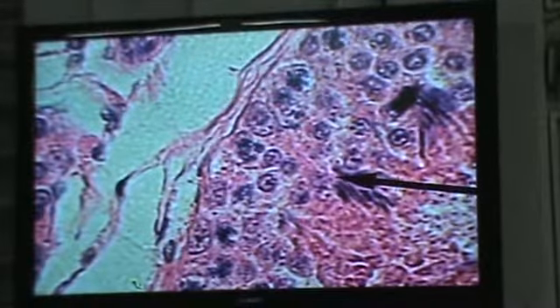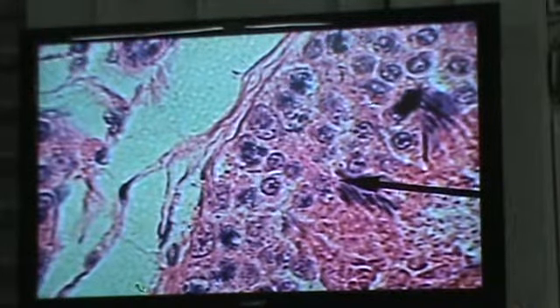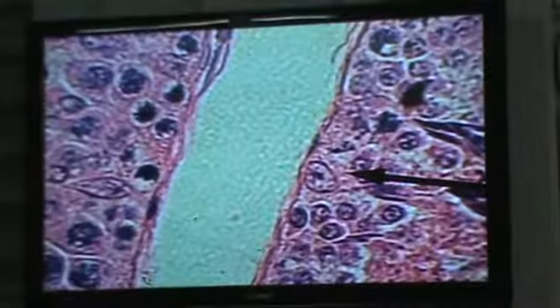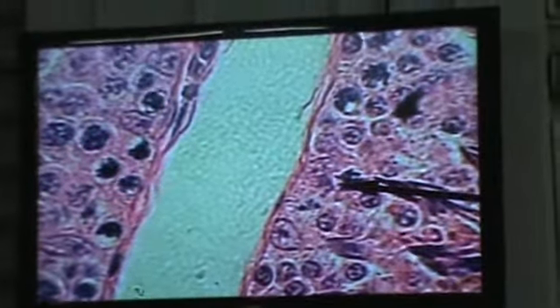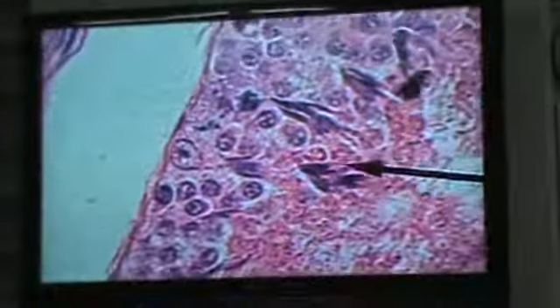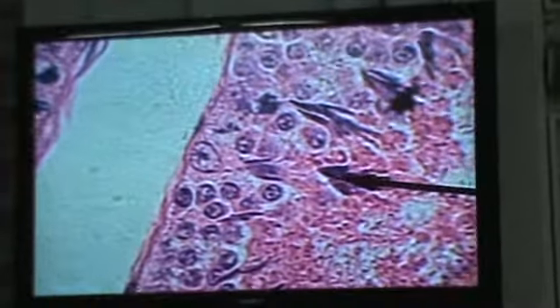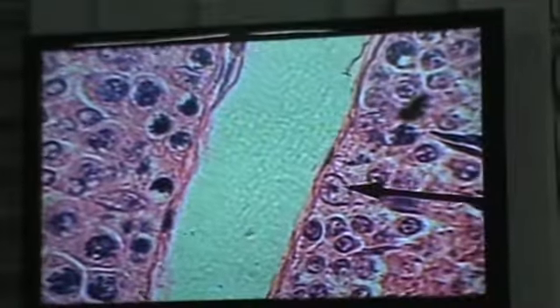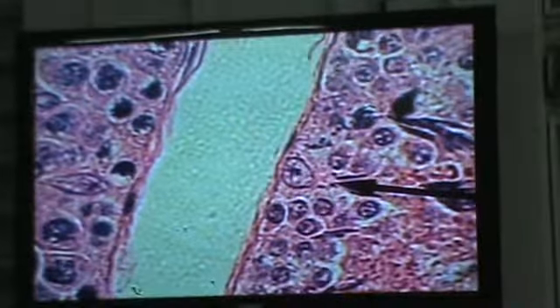You can see the difference in the shape of the nucleus. And all the heads of the spermatids are just packed in there. So there's another one right here. One more. And there's another one, beautiful. So there they are. They're all going into this cell right here. You can see this cell is totally different. So there are different things happening on the side.